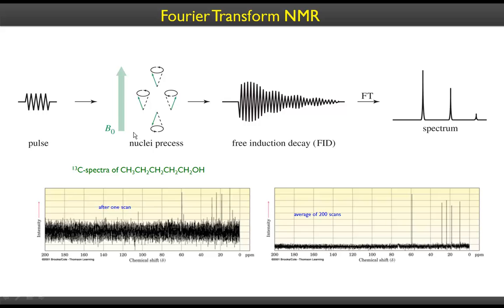So let's say we have a constant magnetic field, and we place our sample, which has a very concentrated solution of our compound, into the probe, and then we pulse it. We supply the radio frequency. There are some computational programs that can automatically set the experiments, and they collect the data in the form of FID. A lot of data points are collected, and a lot of frequencies are overlapping here. This is time domain frequency. So this is converted into frequency domain by a process called Fourier transformation, and you would observe carbon-13 signals.